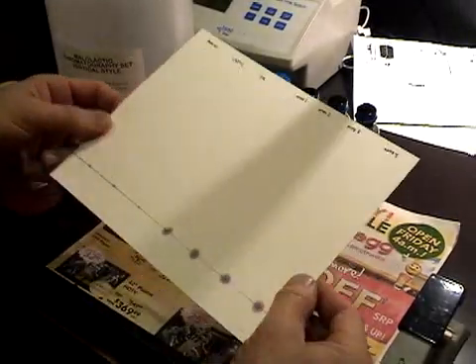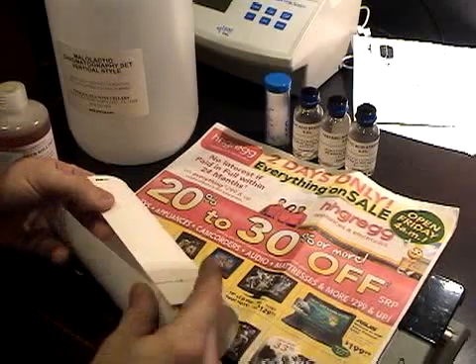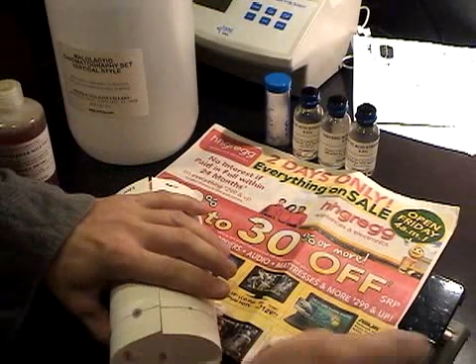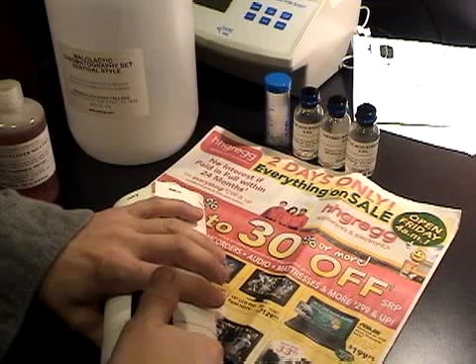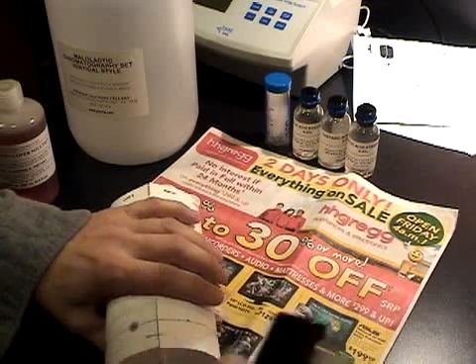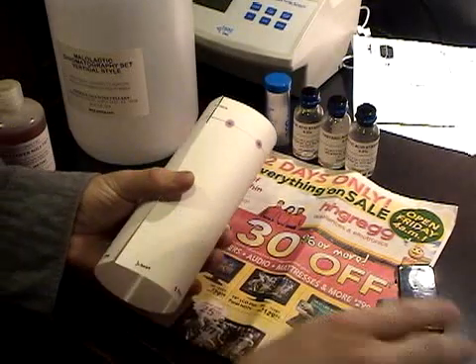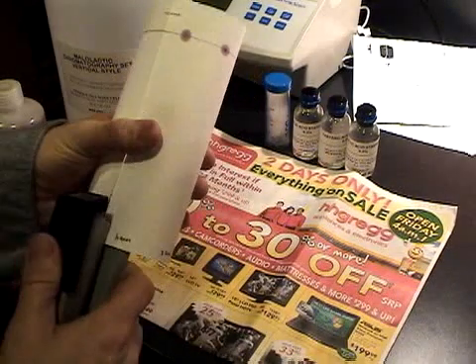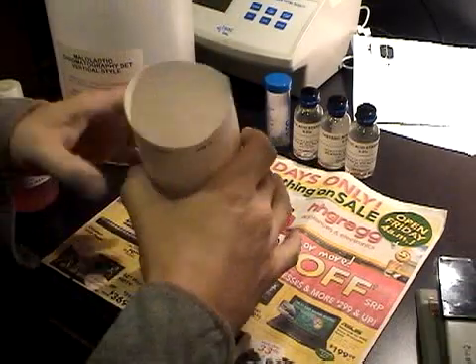Now I'm going to let all of the samples dry for about a half an hour. With our paper dry, we're going to fold it into a cylinder making sure not to overlap the edges of the paper. We're going to staple it on the top and the bottom.